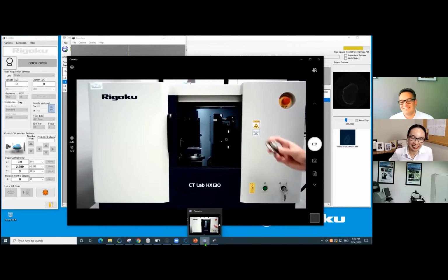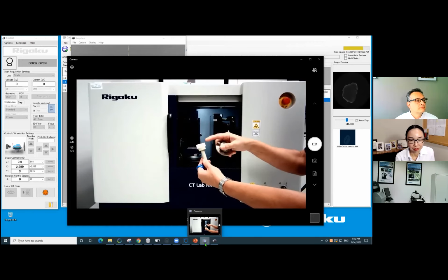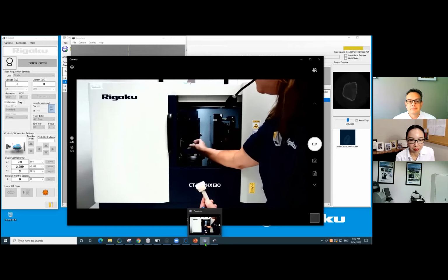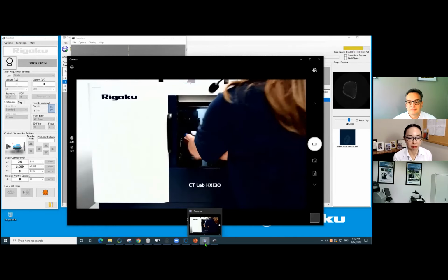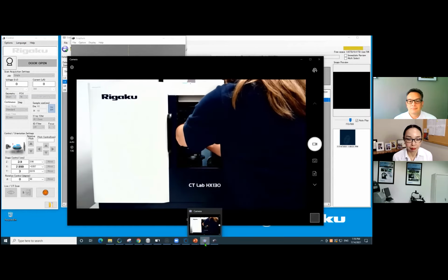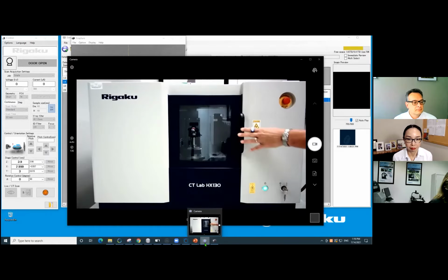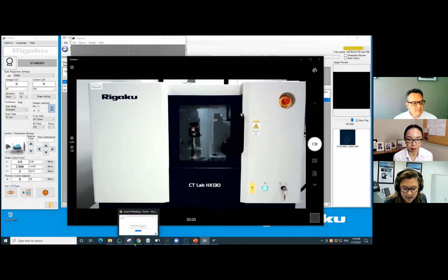Yeah, that's right. I'm going to use a smaller post with a little bit of foam, and some double-sided tape to put my supposed candy with wrapper on. We said N, correct? I'm just going to put this on here and push down a little bit to make it stay, and close this. While you were taking the poll, I changed some settings.